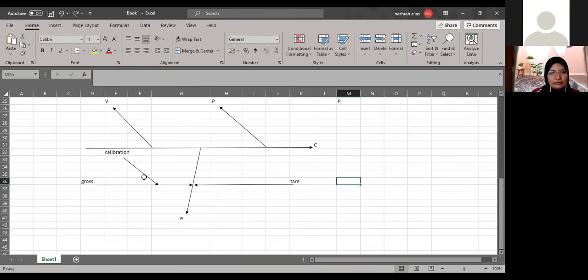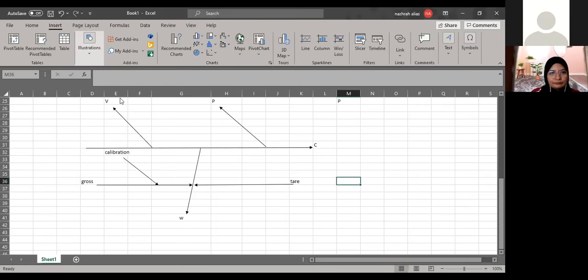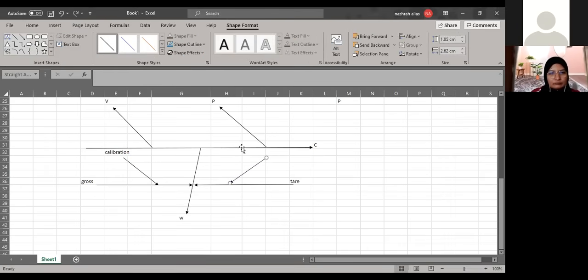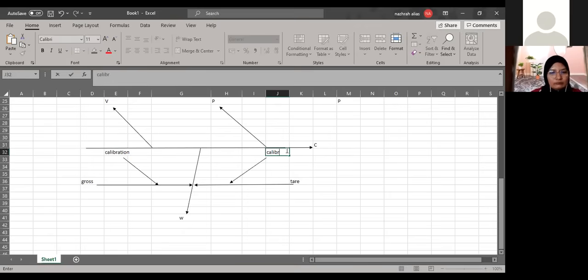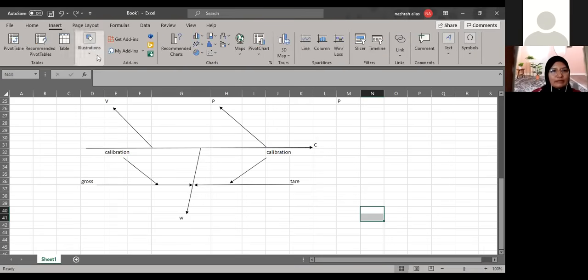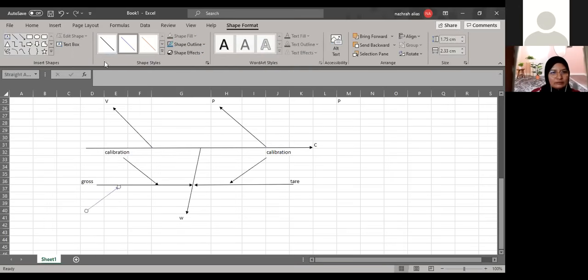We consider the same thing on the other side. So you have calibration and calibration uncertainty. If you look at the slide, you saw that uncertainty in weighing has three factors: calibration, reproducibility and repeatability, and readability. It is okay if you are confused by this fish; it is not easy for me to explain virtually, but I try.